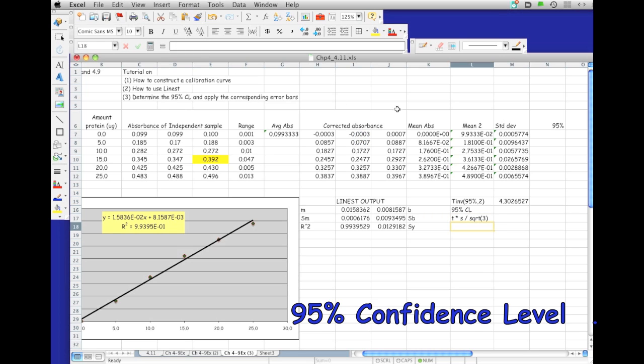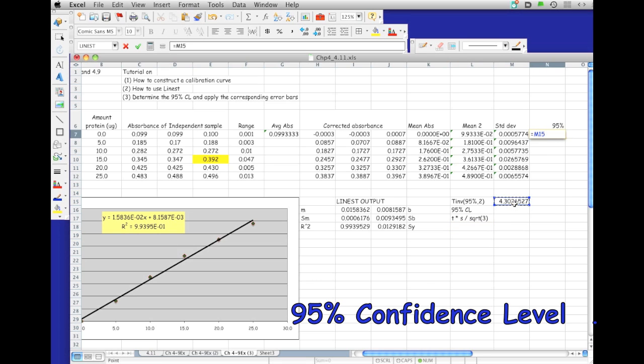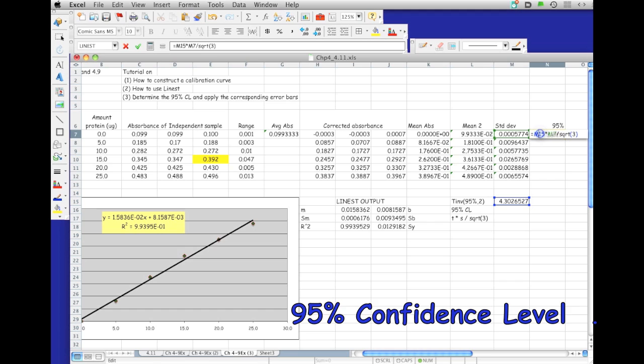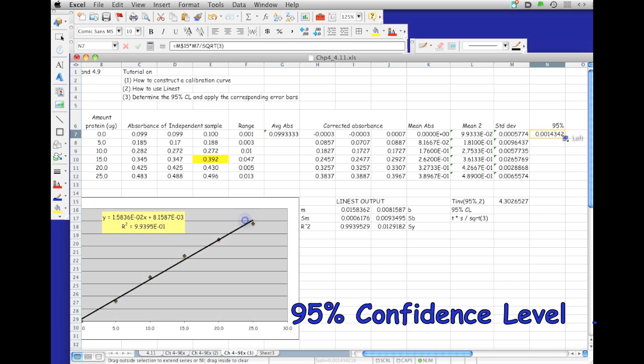That's going to be the equation for this column. I'm just going to say equals the t value times the standard deviation, divided by the square root of three. I also want to make this value fixed, so I'm going to put a dollar sign. Then I want to do a propagation of calculations.